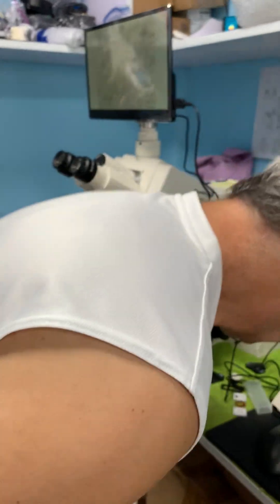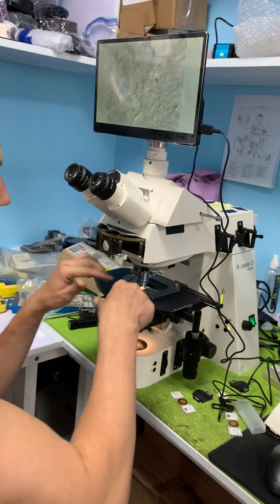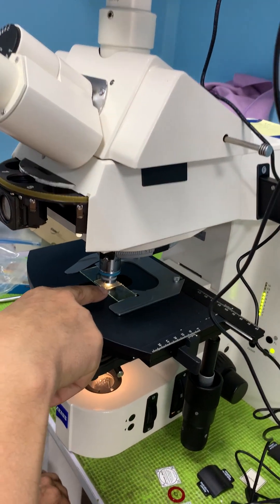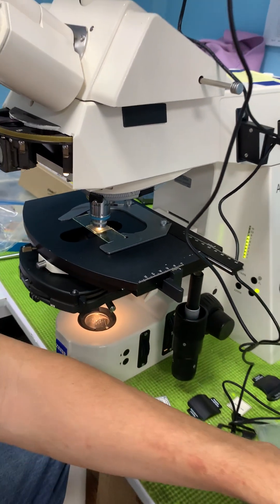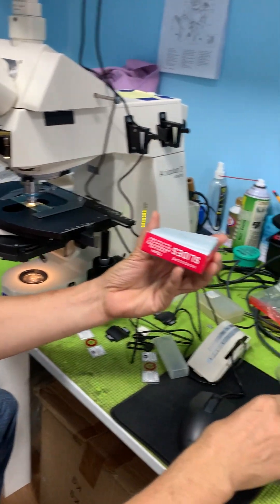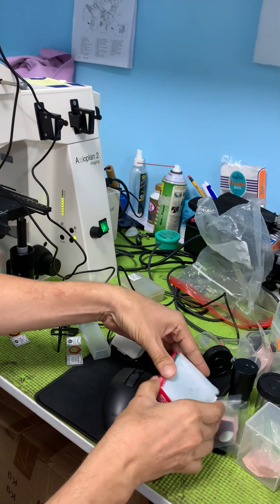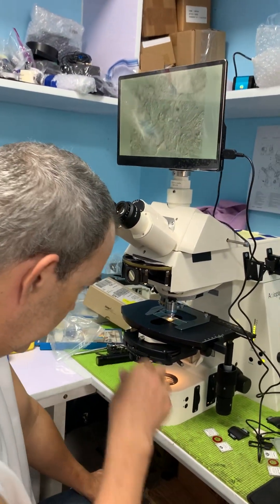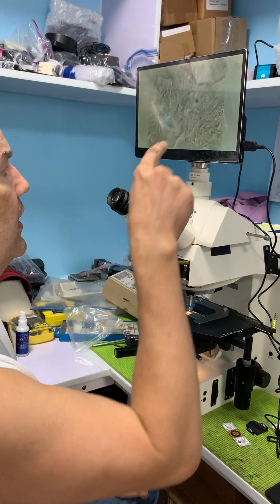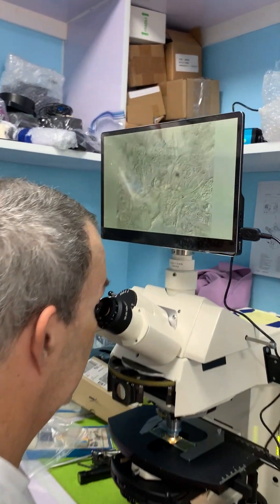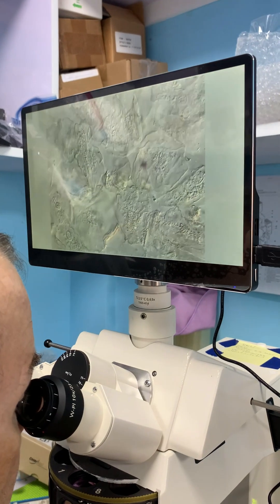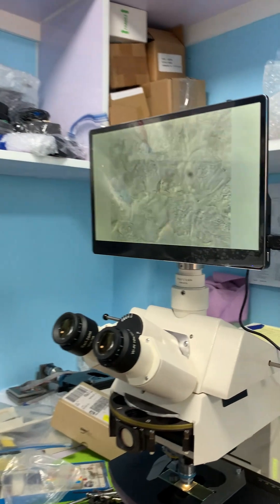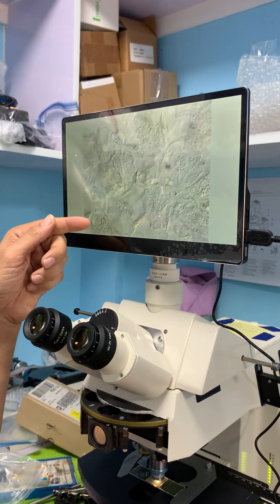We've got a cheek slide — simply made by taking a toothpick, a slide, and a cover slip. You scrape the inside of your cheek to get epithelial cells, and we're looking at that on screen and also in the eyepieces. I can move it around — you can see the nuclei here.